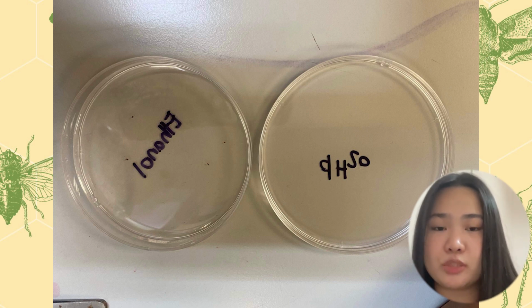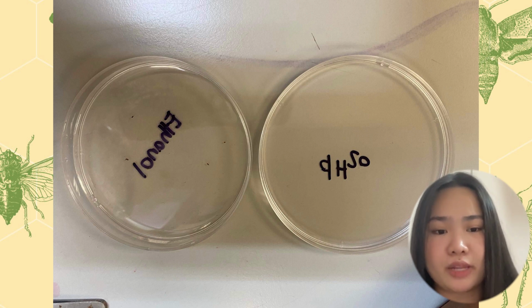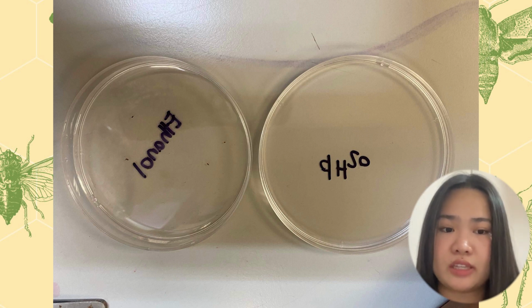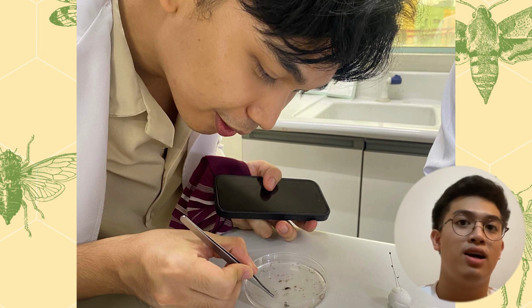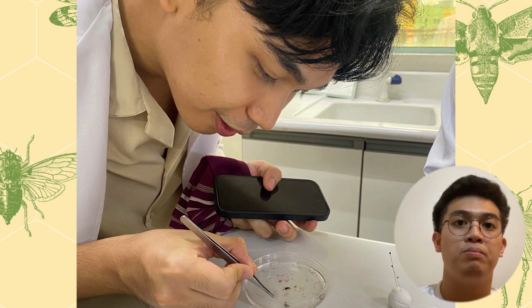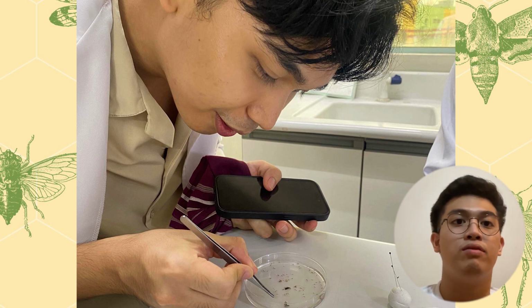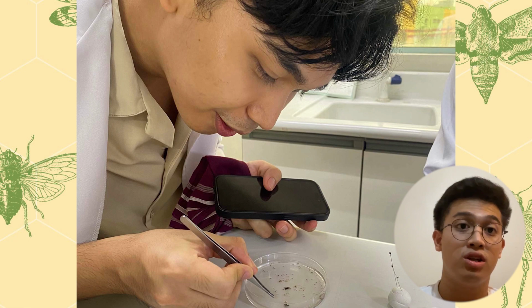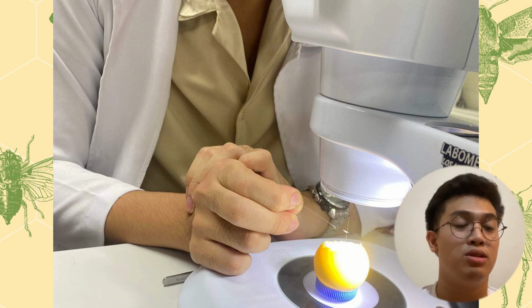Each ant that we captured was put in a petri plate using forceps that contained 90% ethanol, and it was then moved into another petri plate that contained distilled water. After this, we preserved it in a test tube that contained 90% alcohol, and then we meticulously documented our findings for better identification of the ants that we have. For our third laboratory activity, we studied the craft of mounting insects, while the ants were carefully pinned on paper stages. The ants were pinned through the thorax and positioned with their heads facing the left. Then, using a dissecting microscope, we looked at them from a ventral and dorsal view. These observations served as the foundation of our documentation, which was an important step in the identification procedure.